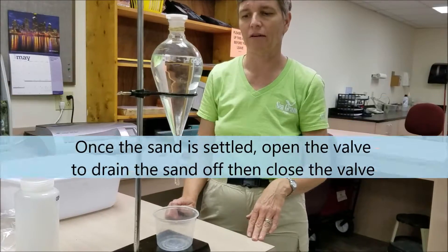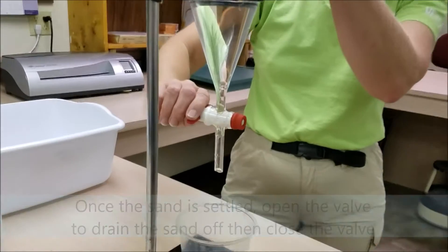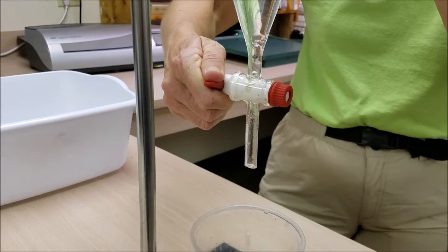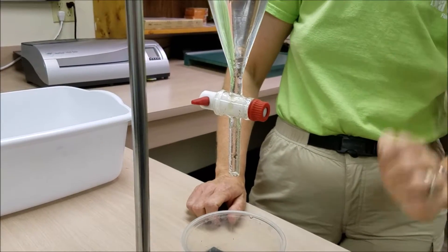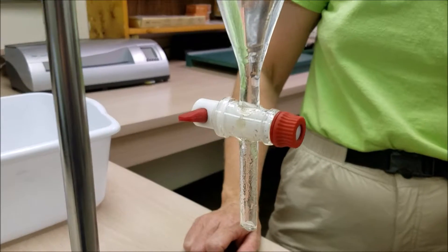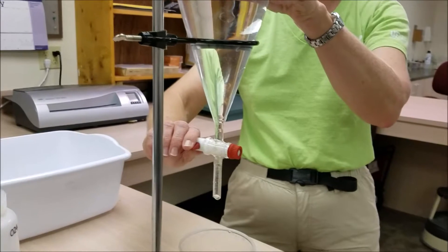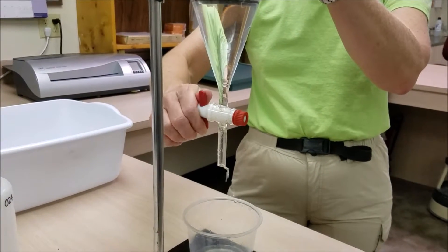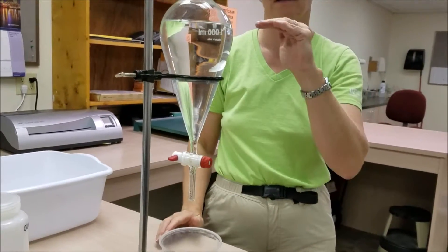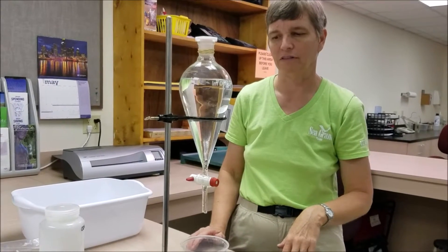Once your sand is settled — you see that layer there at the bottom of the flask — we're simply going to open the valve and drain that sand off, then close the valve. We'll wait another minute or so to allow some additional sand grains to fall and drain those off. We're not too worried about losing plastics in the sample because the plastics should be floating up close to the surface at this point. We should just be removing sand in this manner.